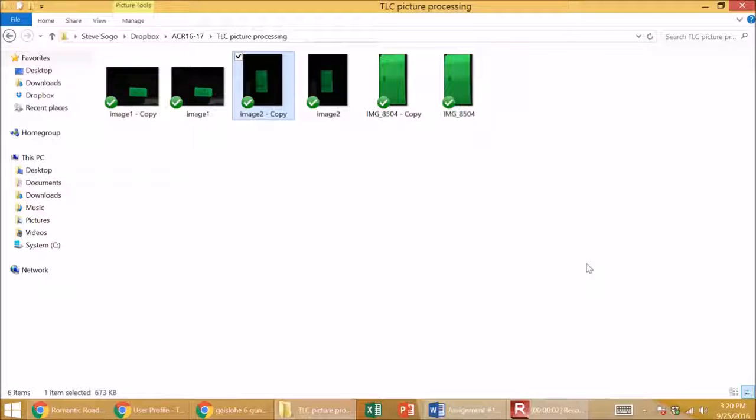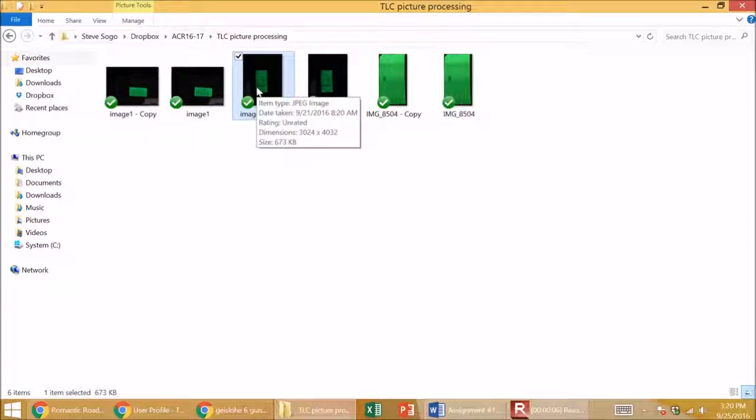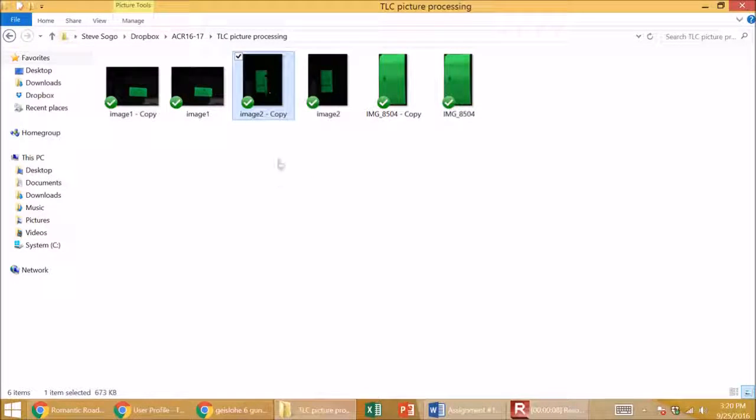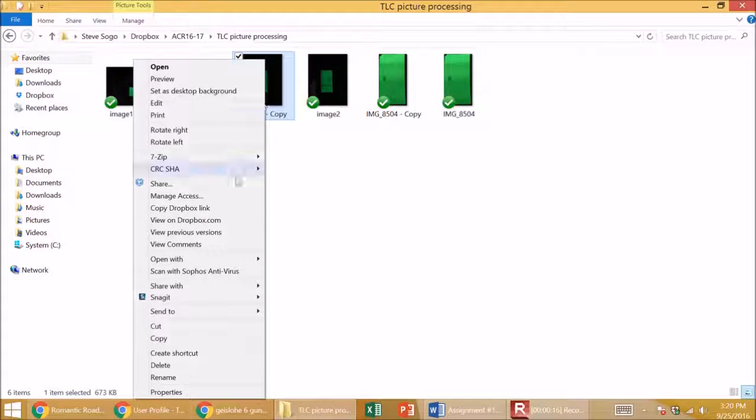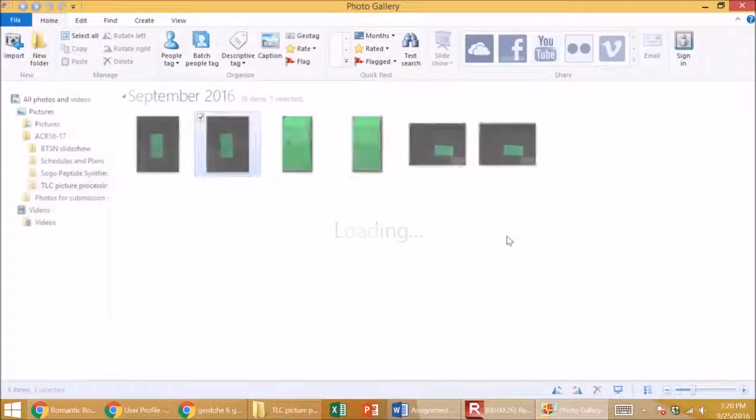I'm going to demonstrate how to process TLC photos that are in color to make them better for printing. Here I have a photo. I will open this with Photo Gallery, that's a Windows program, and I will edit this.